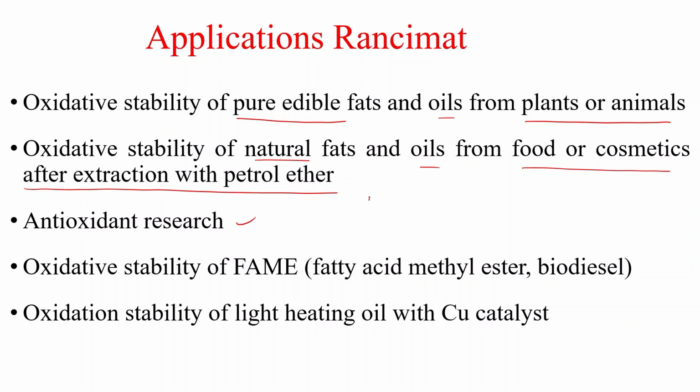Say, for example, a sample has BHA, and another BHT, and another TBHQ; different antioxidants are there. The antioxidant which will have the minimum induction period for the sample, that is, if it is incorporated in the same sample, say we are incorporating BHA, BHT and TBHQ in a ghee sample, the one which has a lower induction period will have the minimum antioxidant efficiency, that is obvious.